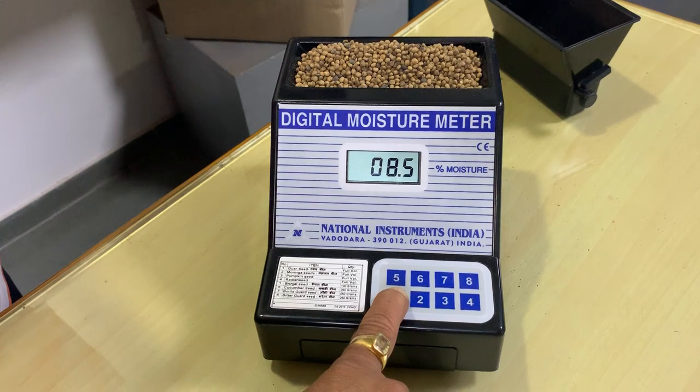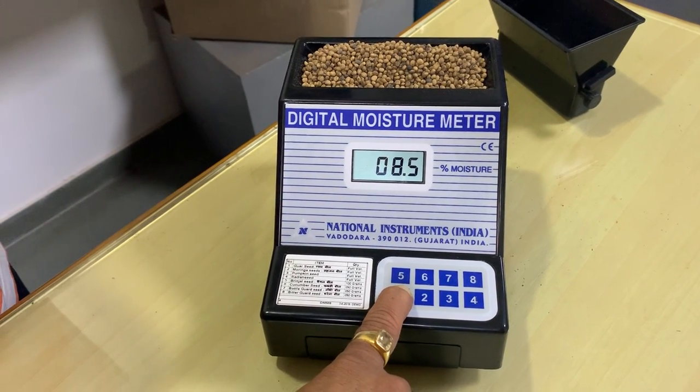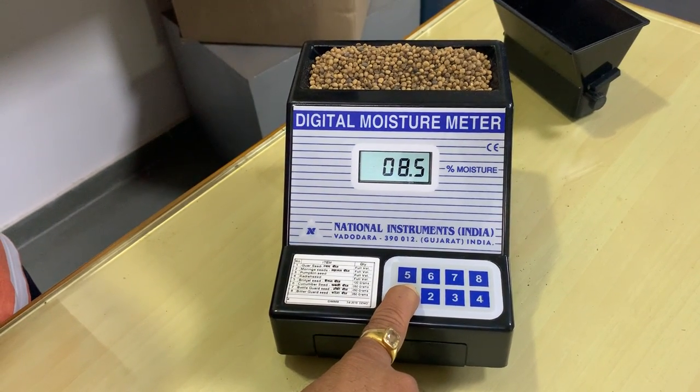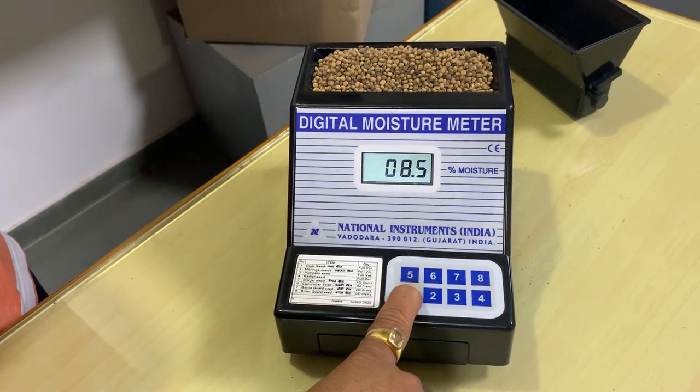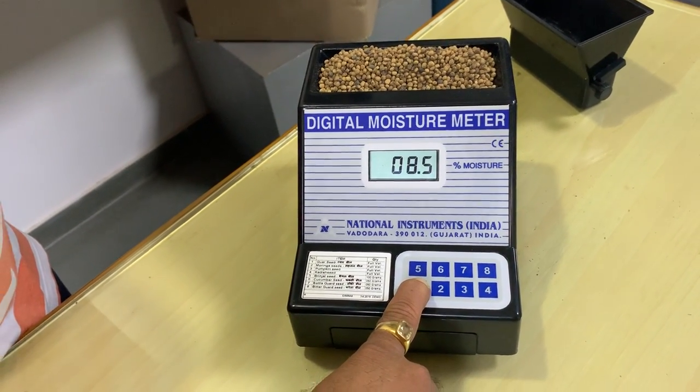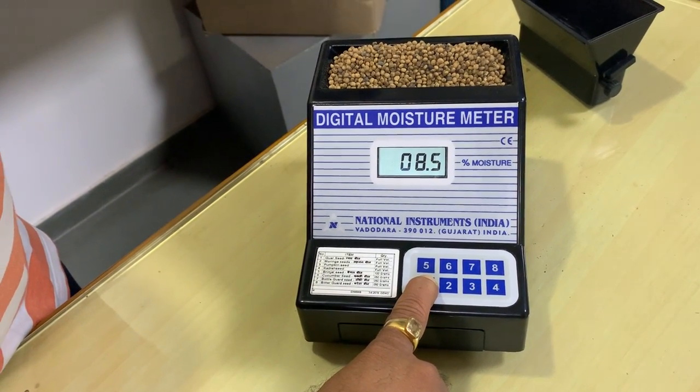It is showing 8.5% moisture, which means this Guar seed has 8.5% moisture content. This is quite good for germination — the seeds are quite dry and this maintains the quality of germination as well.